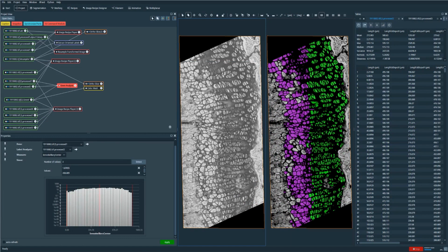In this use case, we are going to show you how to characterize the growth plate of the bone using automatic segmentation and quantification tools available in Amira software. The data are kindly provided by the InnoScale company. First of all, here, this is the complete Amira project.